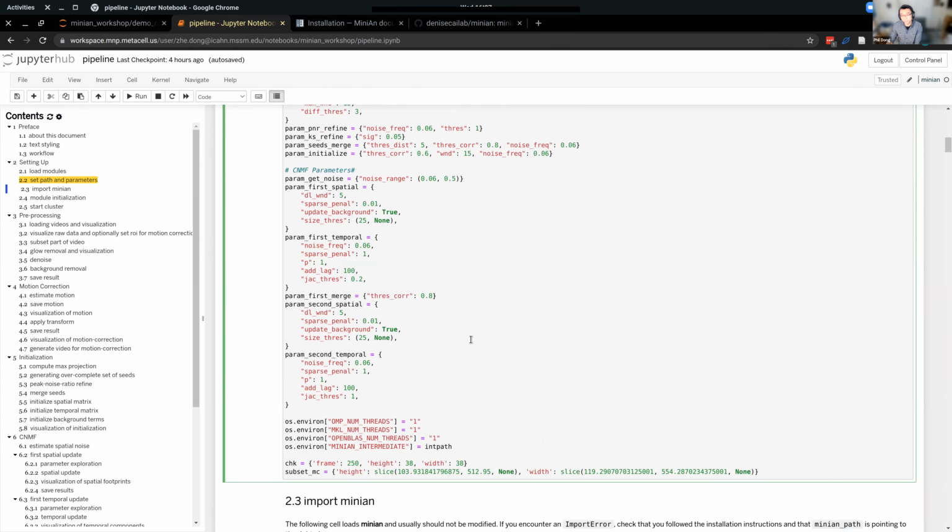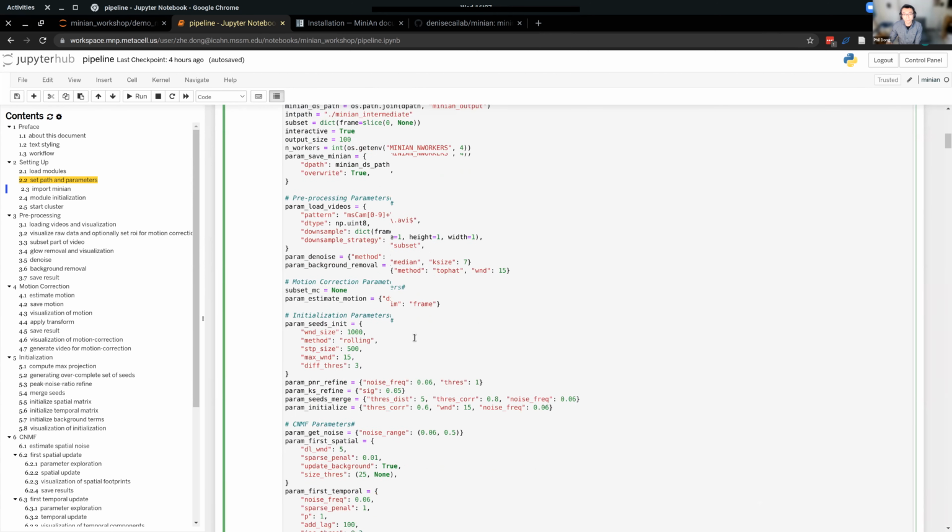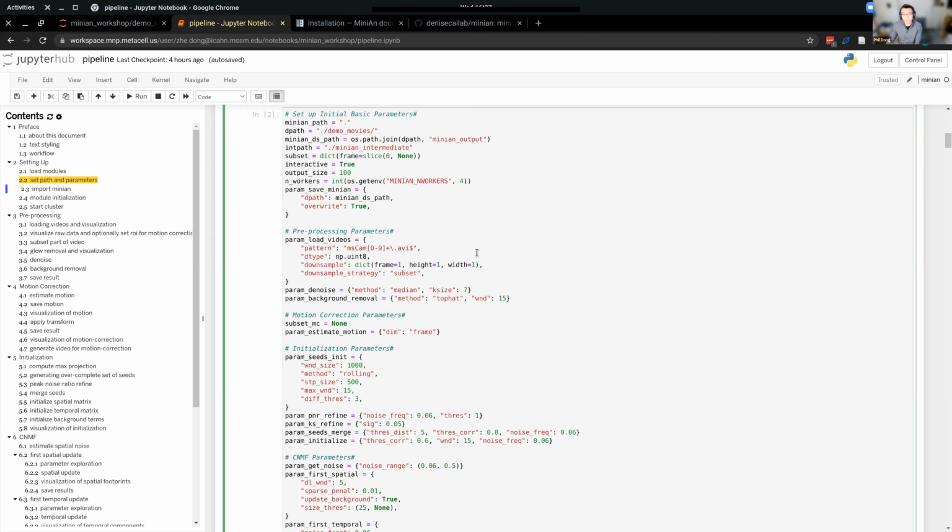But if you get rid of something you do care about, or get rid of some other thing that doesn't matter, as long as you can make your parameters all defined by a JSON file or YAML file, I think Papermill is definitely possible.